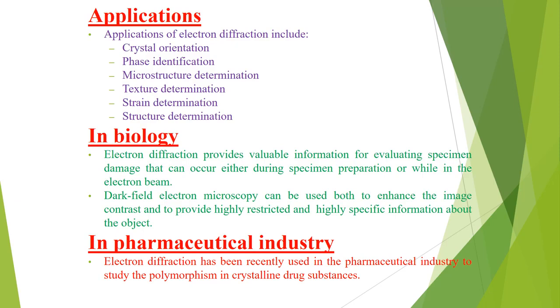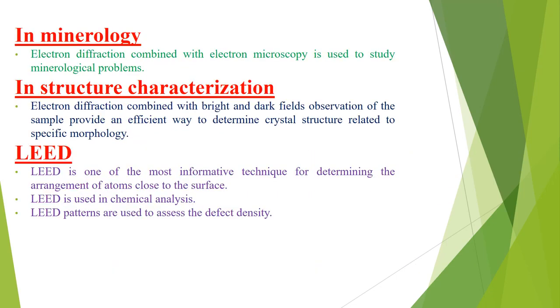In the pharmaceutical industry, electron diffraction has recently been used to study the polymorphism in crystalline drug substances. In the field of mineralogy, electron diffraction combined with electron microscopy is used to study mineralogical problems.